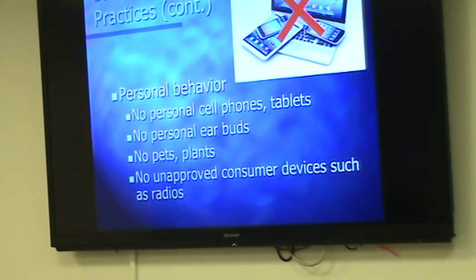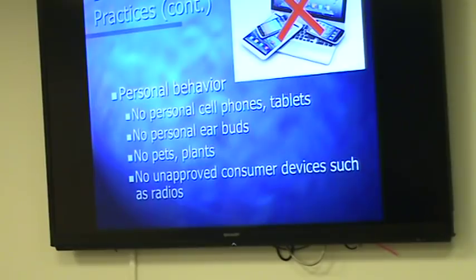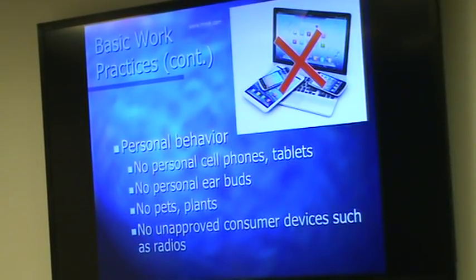Now, personal behavior. When I wrote this last edition of the safety book, I added a section that I didn't have before, because the introduction of tablets and cell phones has created a whole new no-no for the laboratory. There are all sorts of electronic devices, and a lot of them you put up to your face. If the laboratory is a contaminated environment, and you're using your cell phone and then put it up to your face, ugh. These are objects that you really can't decontaminate, and they're very high touch devices. Whatever's on your hands is on that tablet, on that cell phone. So within the laboratory, no personal cell phones, tablets, and so forth.